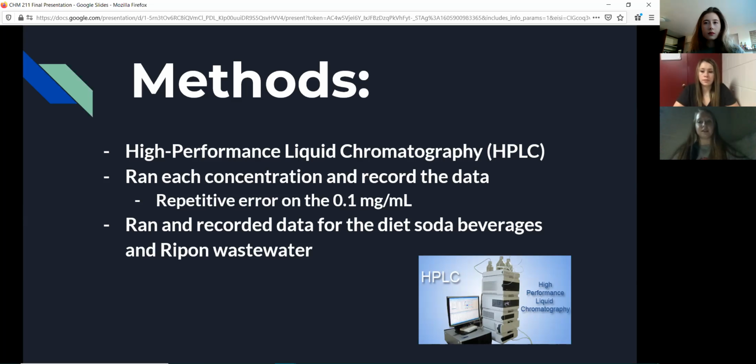molecules flowing past it. This results in a separation of components in the mix, and due to their different degrees of interaction with the absorbent particles, causes different elution rates for the different compounds and leads to a separation out of the column. The separation is then detected by the instrument, resulting in peaks being shown on the screen in order to be interpreted.